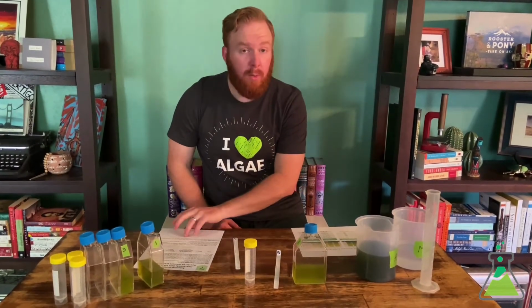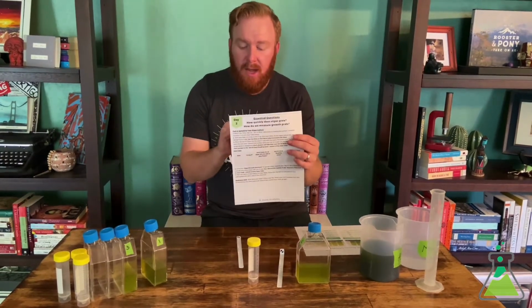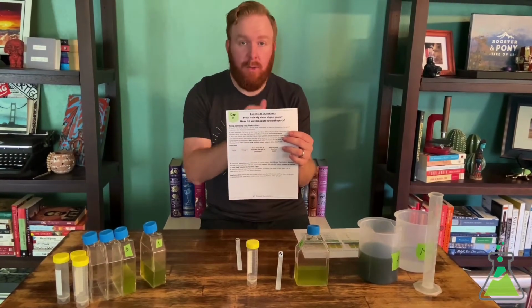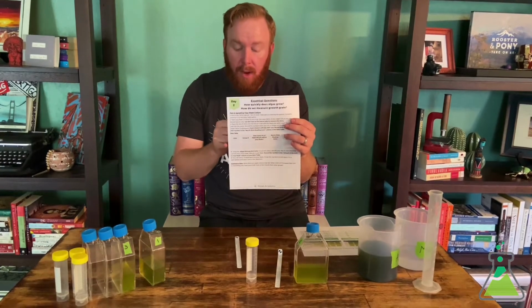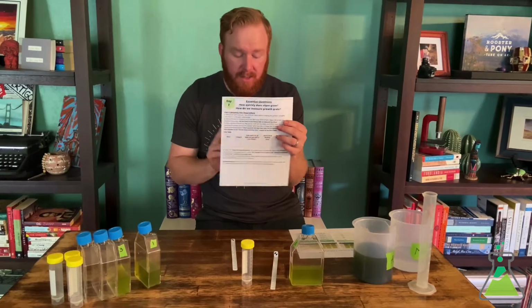So just for your reference, we are on the second portion of our day 2 worksheet, and it should say at the top, part 2, sampling your algae cultures. And there's a table here in gray that's in the middle of the worksheet, and we're going to fill that out as we move through this next activity.